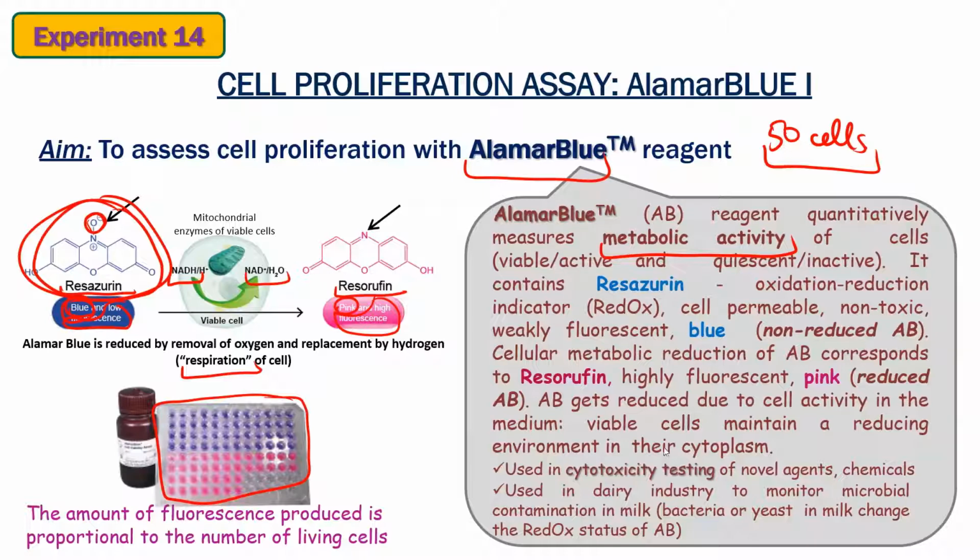Okay, we know that it is related to metabolic activity, so first, we could measure proliferation. Second, we could check if some kind of treatment is toxic for our cells, so we could measure cytotoxicity.